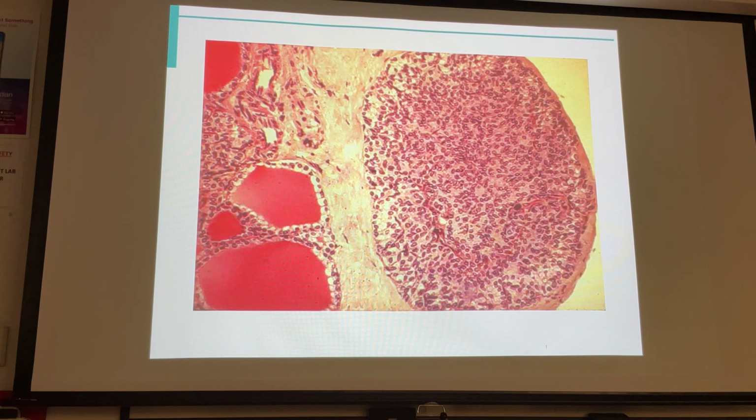So here is an actual parathyroid gland adjacent to, next to, but not a part of the thyroid. We can tell it's definitely not the thyroid because do you see any follicles in here? No. But what you do see is kind of two types of cells. Some of these are kind of darker, smaller cells. Some of these are a little larger and lighter.